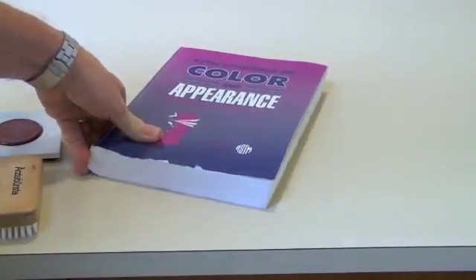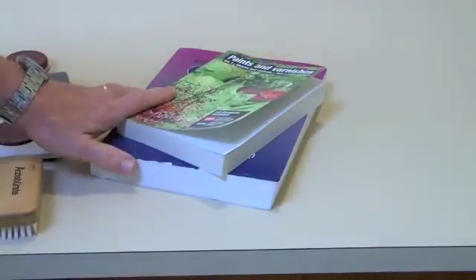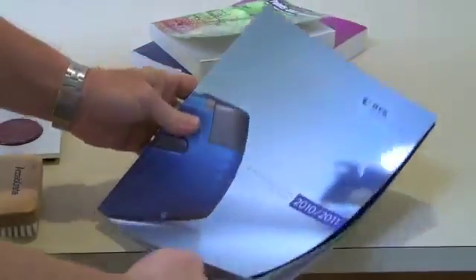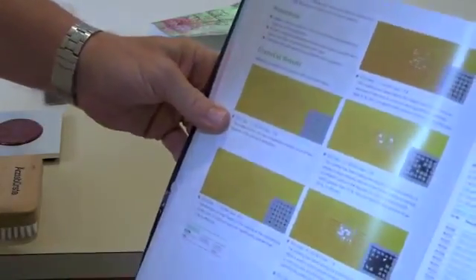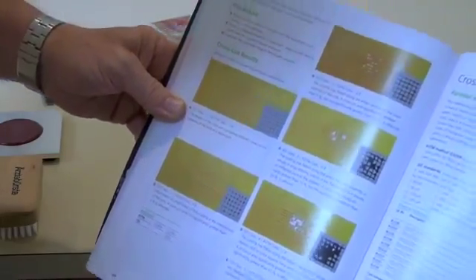To interpret the test, you can use either the ASTM method or the ISO method. You may also find a quick reference in your Bic Gardner catalog. On the 2010-2011 catalog, page 134, you will find a quick and easy color reference of the different classes of failure.